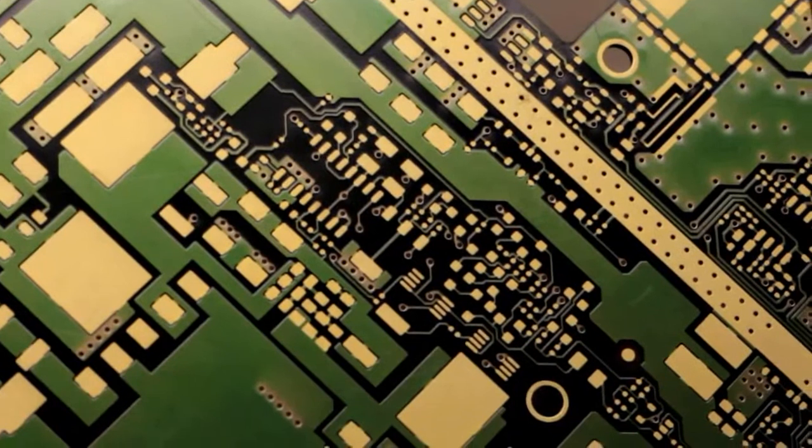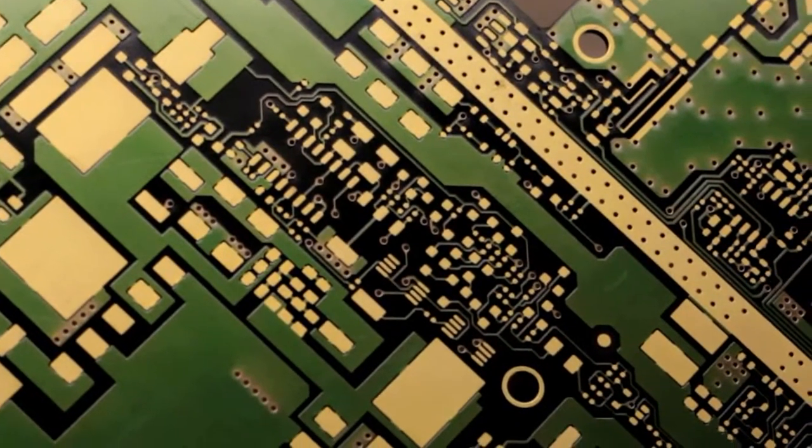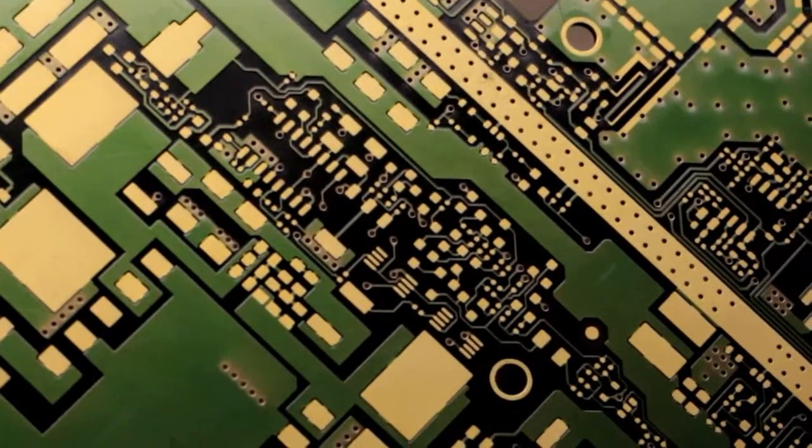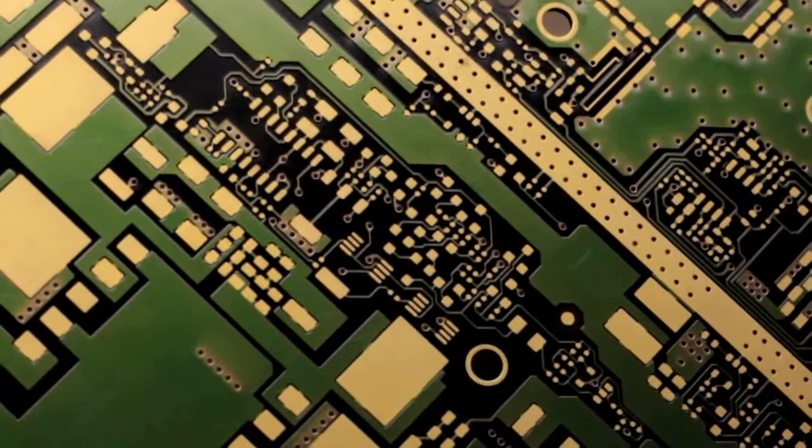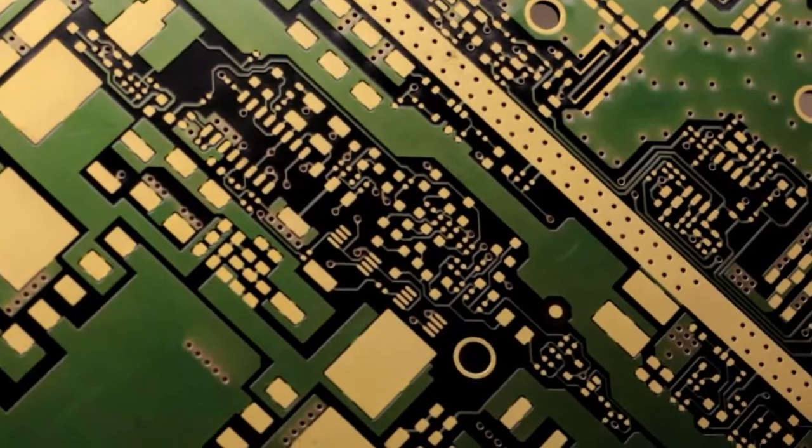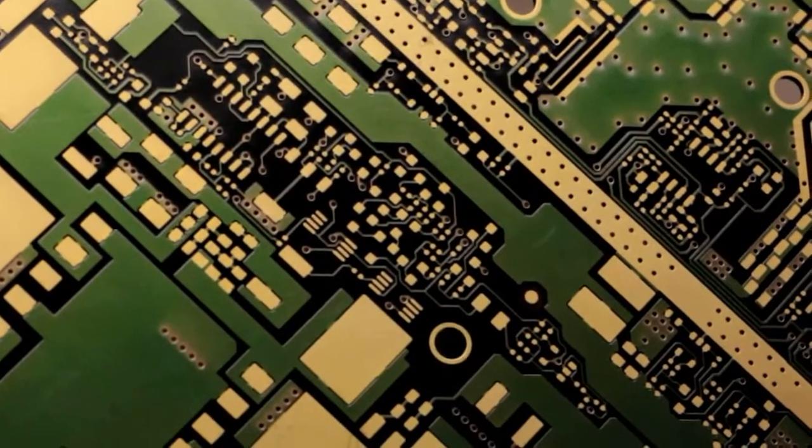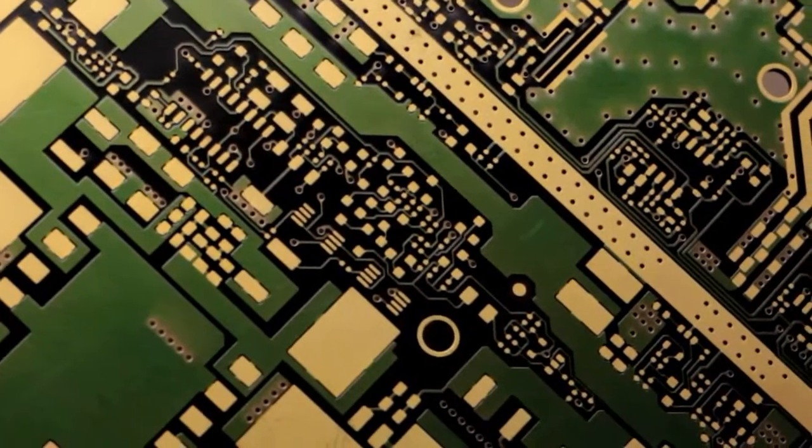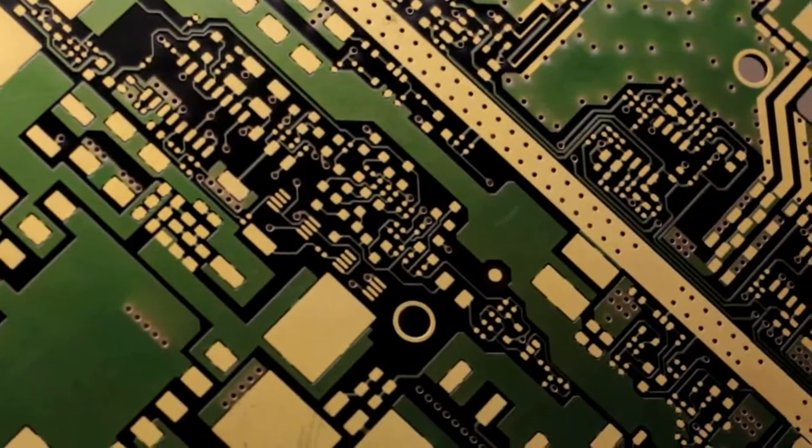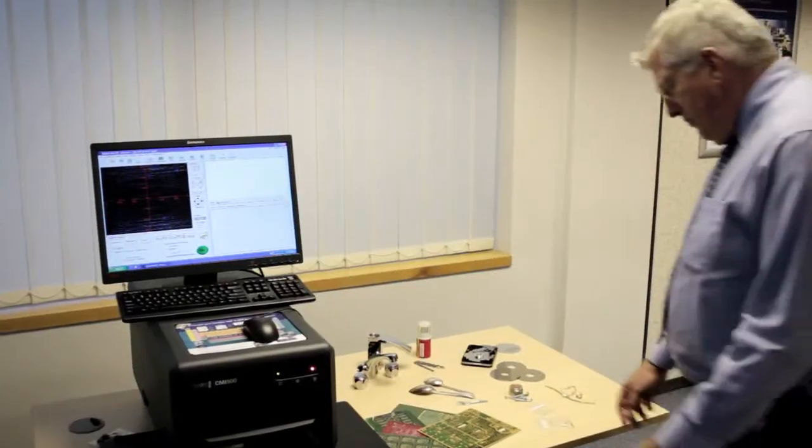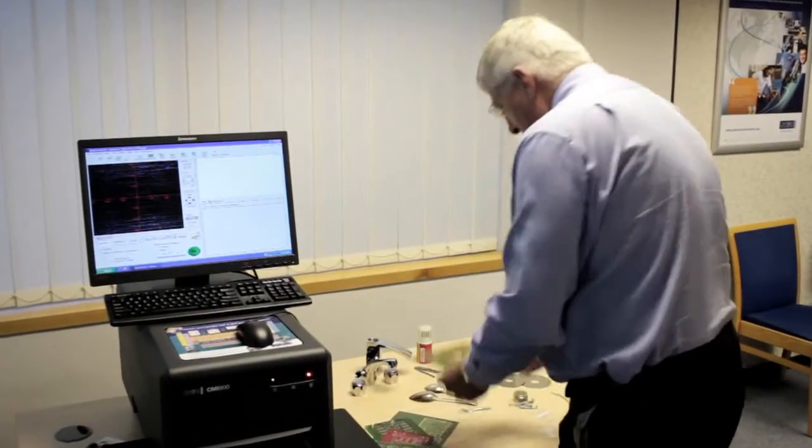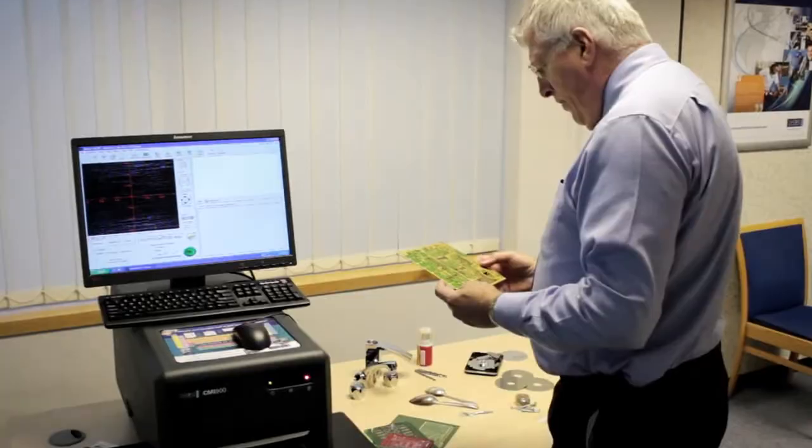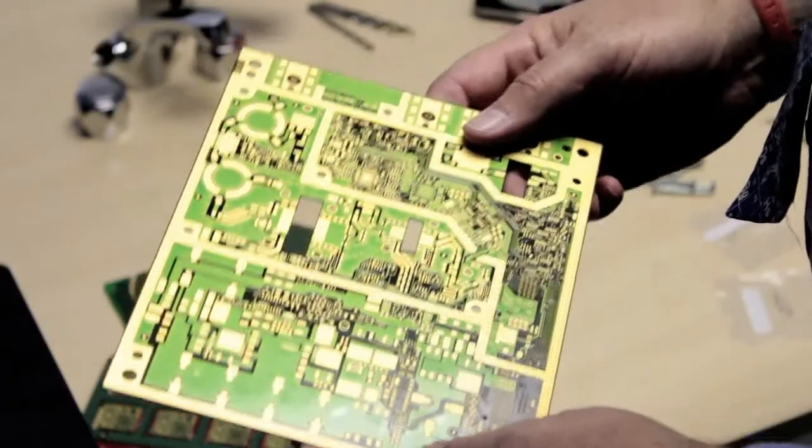As an example for the electronics industry, the quality and reliability of printed circuit boards relies on the coating thickness of gold, nickel, and copper on the board. Analysis with the CMI-900 requires no sample preparation.